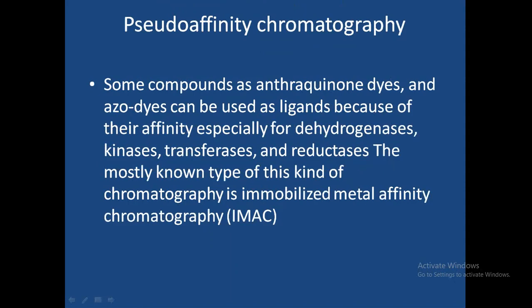And pseudo-affinity chromatography: the principle behind this technique is that some compounds such as anthraquinone dyes and azo dyes can be used as ligands because of their affinity, especially for dehydrogenases, kinases, transferases and reductases. The most known type of this kind of chromatography is immobilized metal affinity chromatography, abbreviated as IMAC.